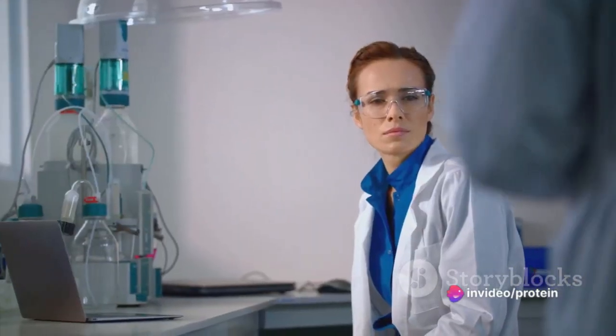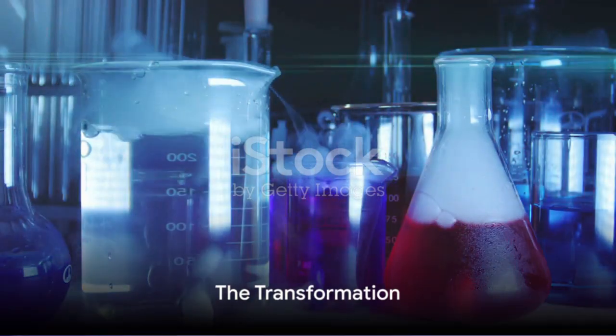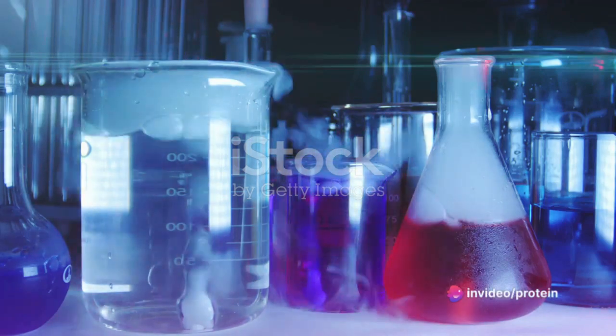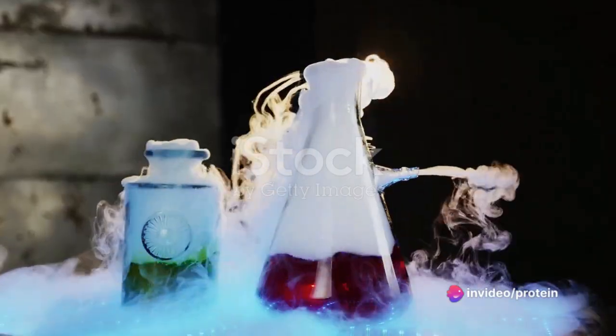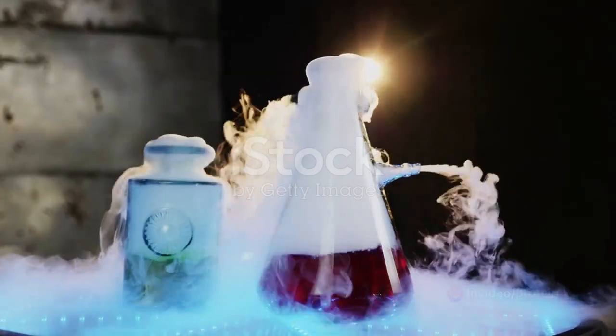But don't touch the petri dish. It will get very hot, and safety always comes first in any experiment. The heat causes the sucrose to break down into its component parts, fructose and glucose. But it's not over yet. The high temperature further breaks down these simple sugars, leaving behind a mass of carbon and steam.